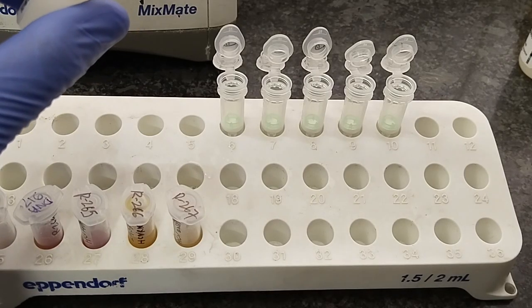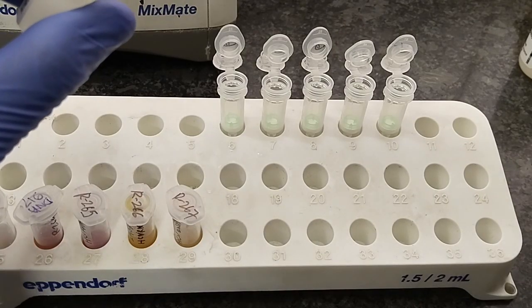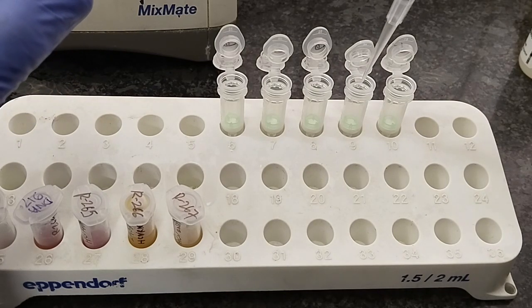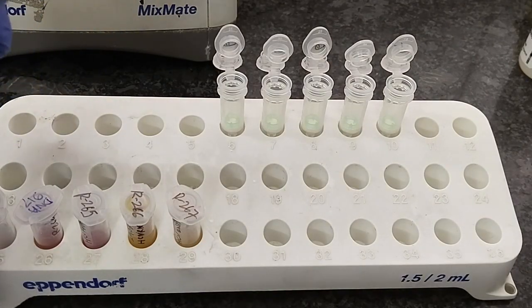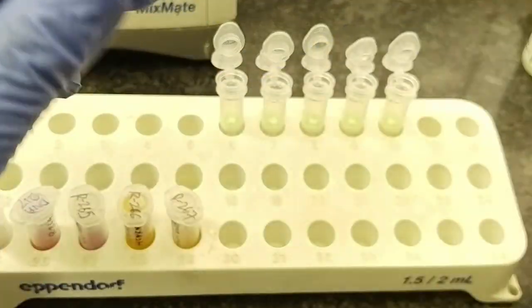Then it is centrifuged at 12,000 rpm for 1 minute, and the procedure will be completed. The addition of elution buffer is completed.